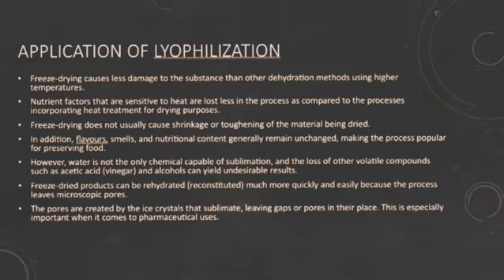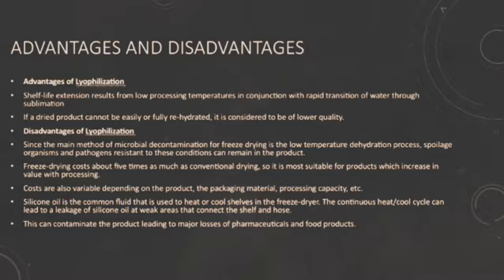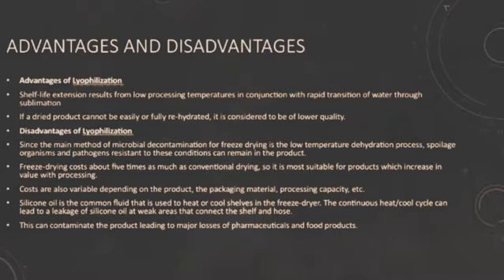The advantages and disadvantages of lyophilization. Advantages: the process causes less damage to the substance compared to other dehydration methods, and flavors, smells, and nutritional content generally remain unchanged. The resulting product has microscopic pores that allow it to be rehydrated quickly and easily, which is especially important for pharmaceuticals. Disadvantages: it is about 5 times more expensive than conventional drying and may not kill all spoilage organisms. There is also a risk of contamination from silicone oil leaks from the freeze dryer's heating system.